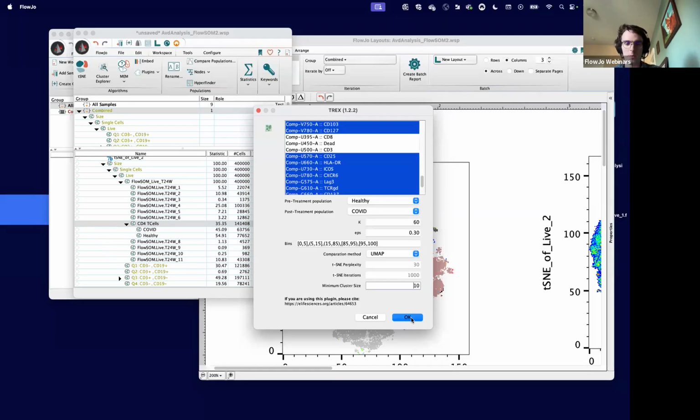I'm not going to actually run the algorithm again, just because it's going to take a few minutes to calculate. I already have the results, so I'm just going to pull those up. It is also 5 p.m., so I apologize. I'm going to go a few minutes over just to show you the T-Rex results.